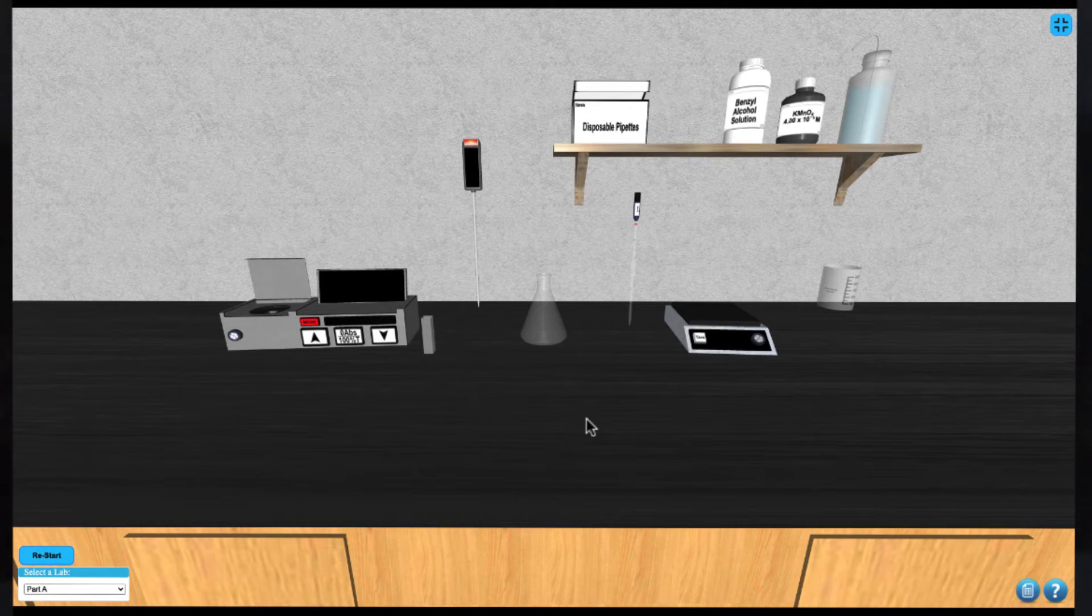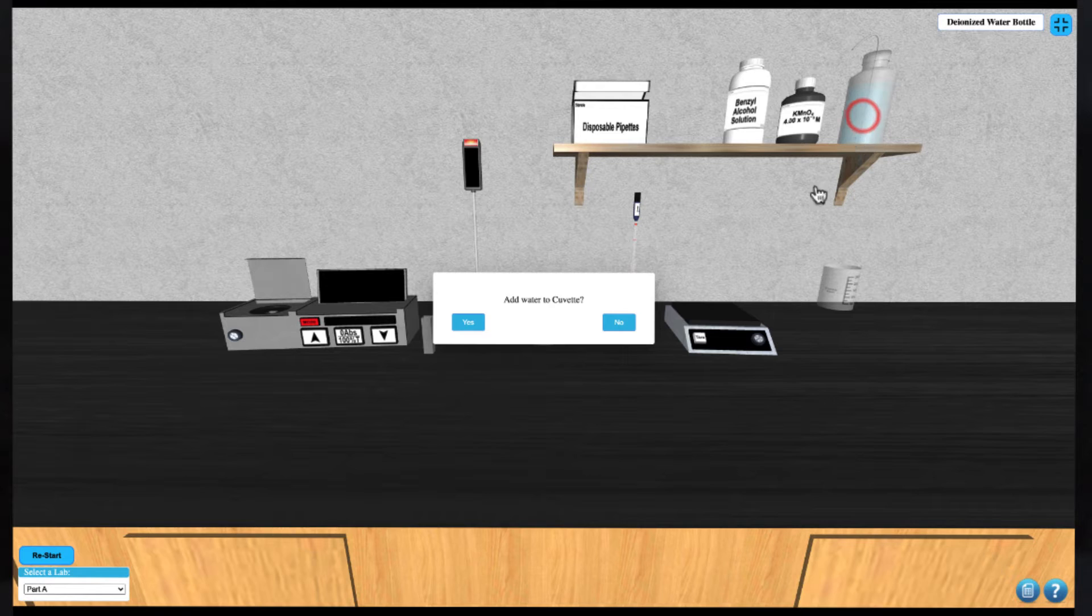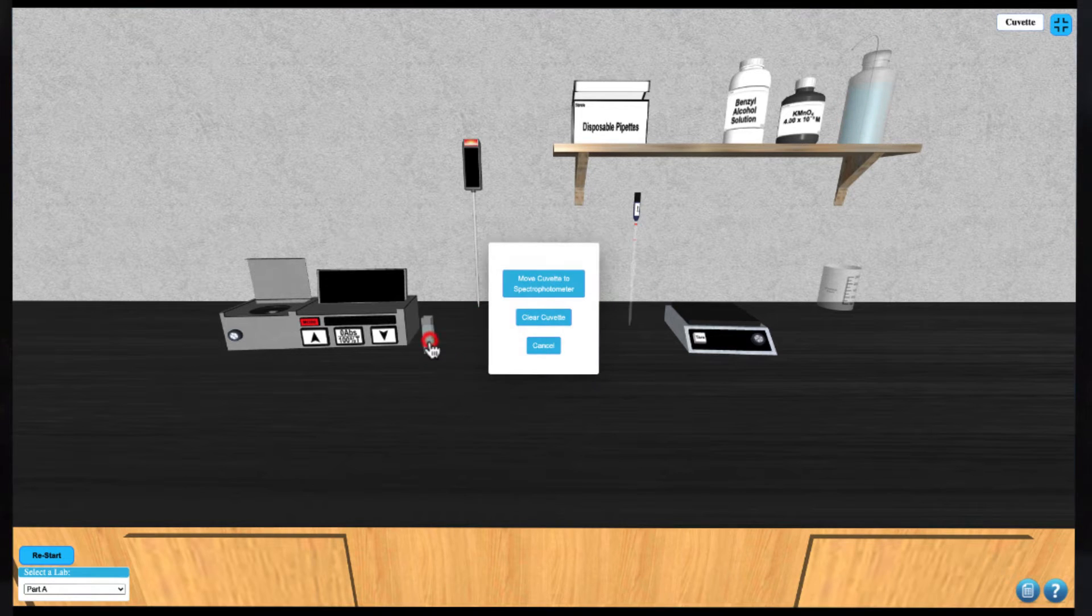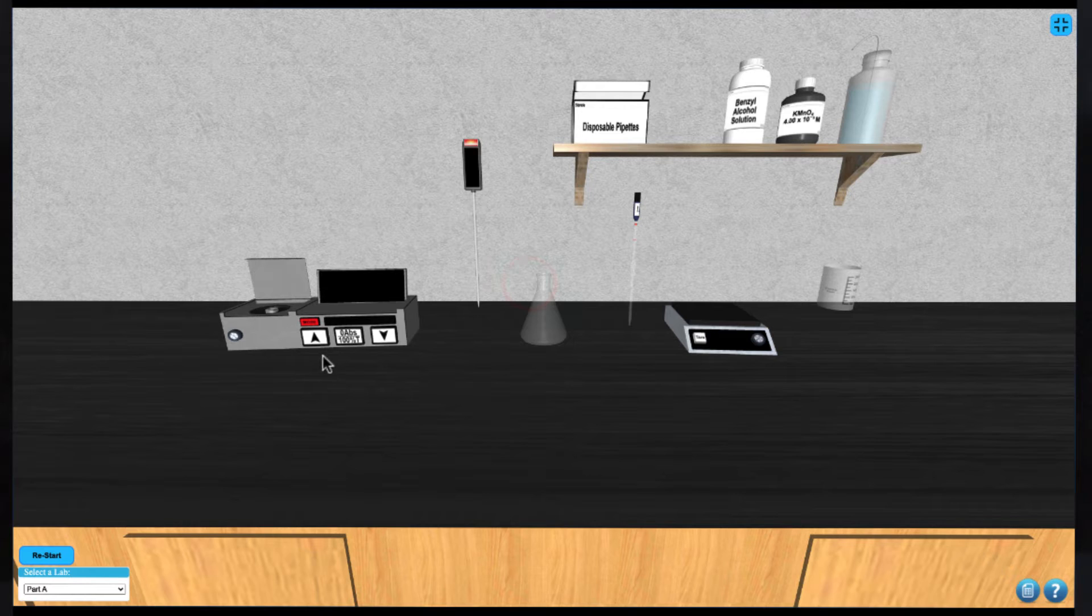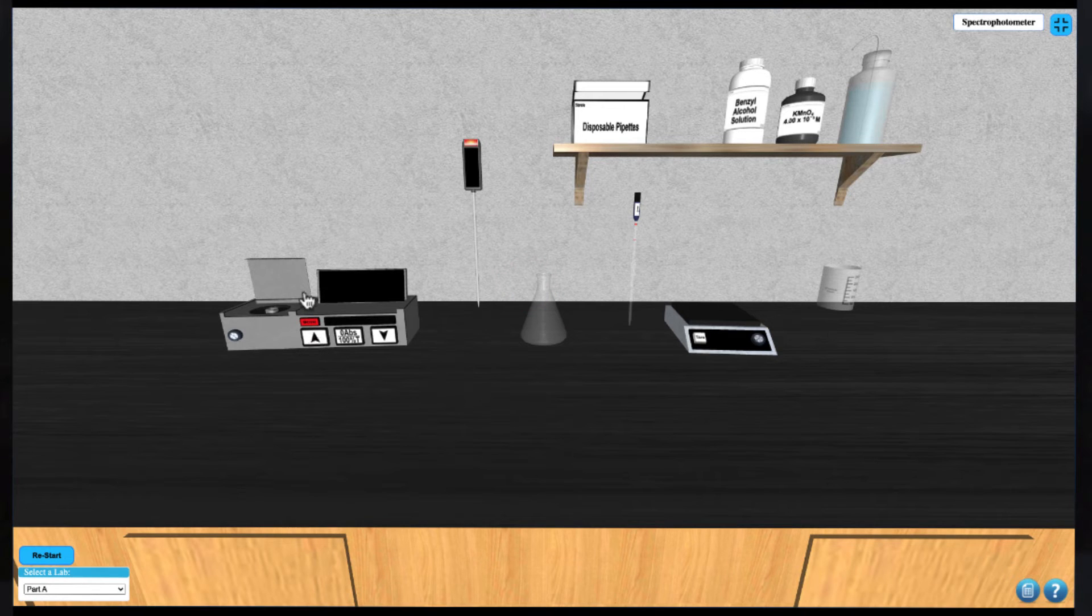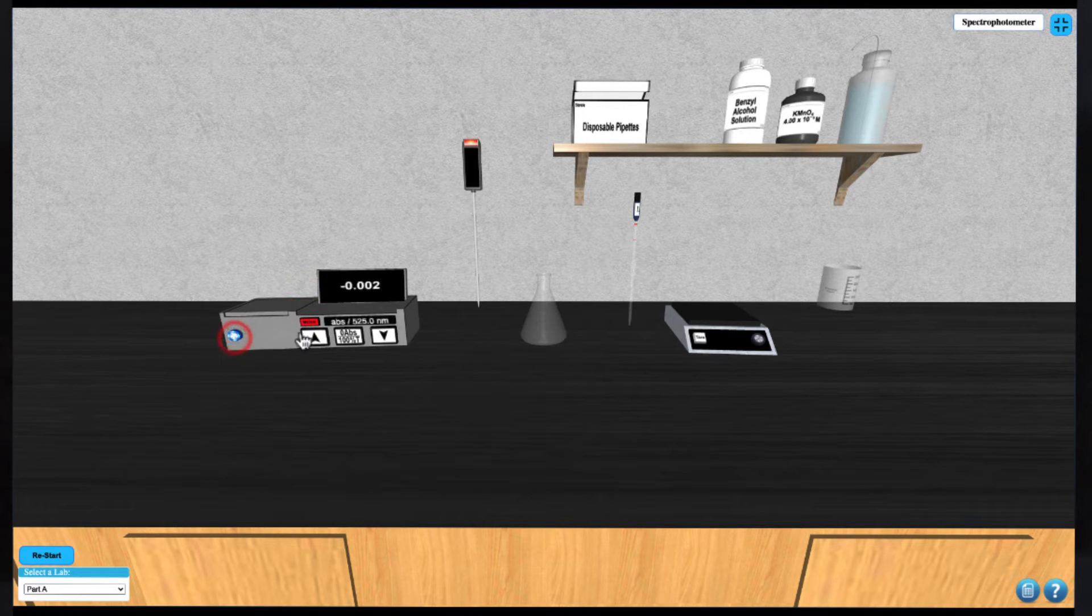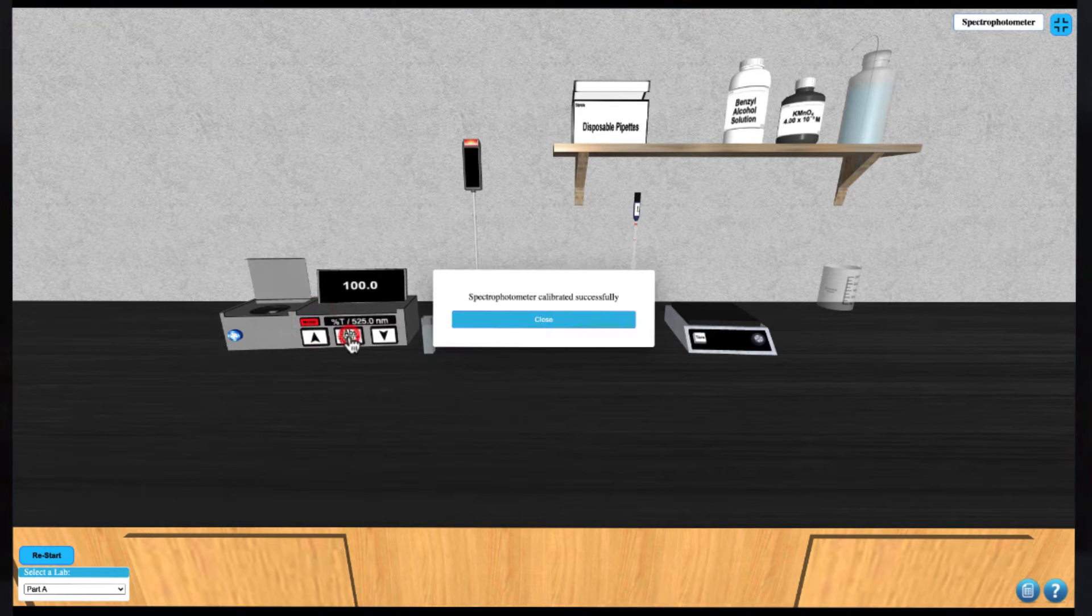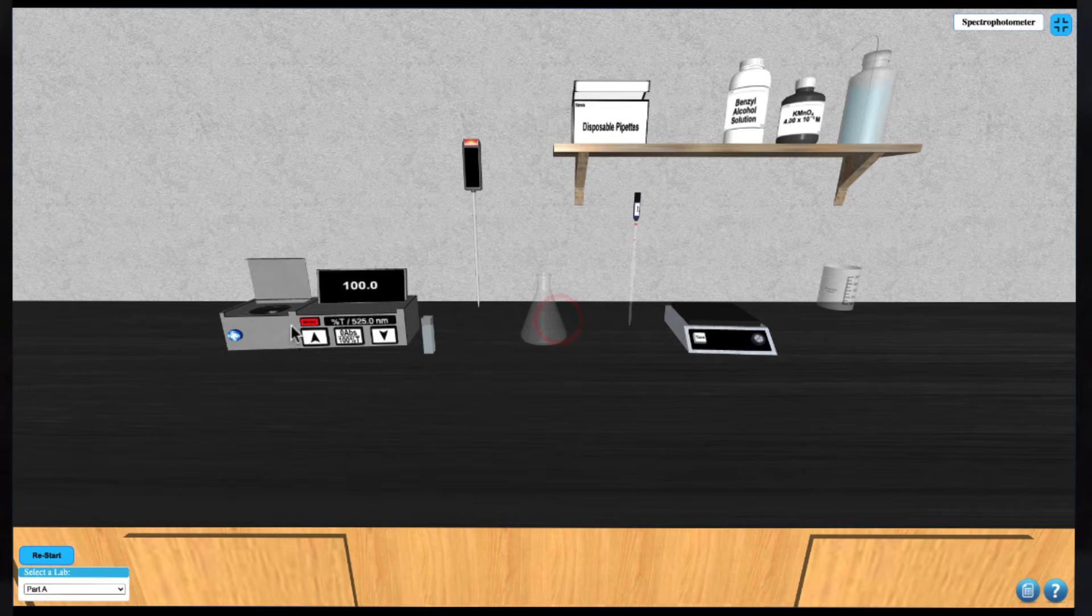To begin we must first calibrate the spectrophotometer. Click on the water bottle to add some water to the cuvette and then click on the cuvette to add it to the spectrophotometer. Turn on the spectrophotometer and change the mode to transmittance. Close the lid and click the middle calibrate button to calibrate the instrument.